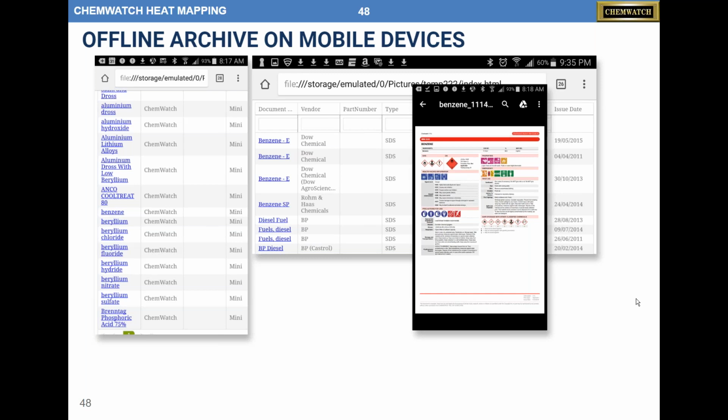I just pull it up in a web browser. I'm able to do very rudimentary searches, and then I can put that information on the screen, click on it, and the SDS will appear. So our offline technology is actually really good, and having the phone gives it the next level. So you could actually have that information remote, in areas that have no internet connection.